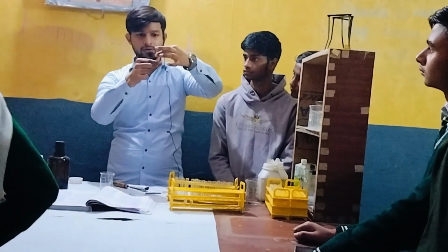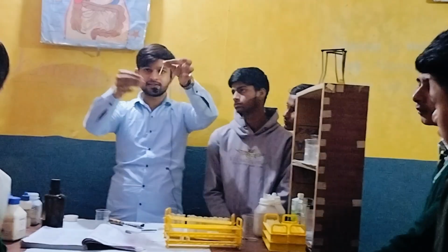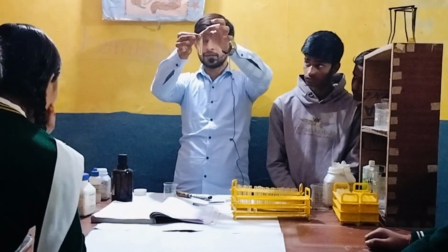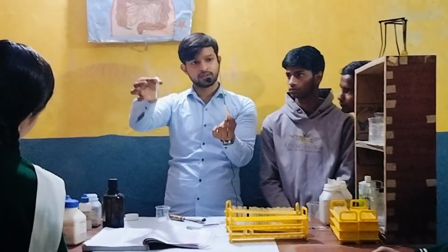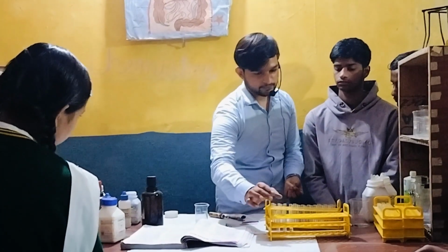Let me fold. Now just see. Let's see what is in this test tube. I think nothing happened. Can you observe some change? No. So this is water. Okay. This is water. Because nothing happened. See, pH paper same. So this is water.